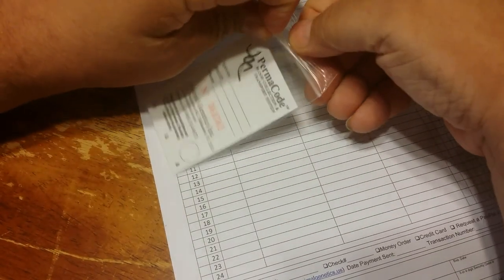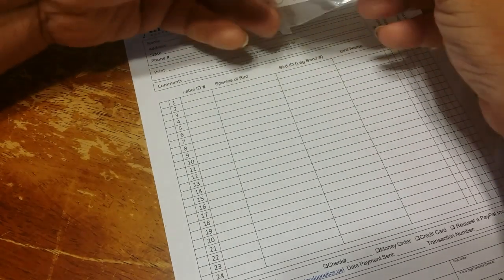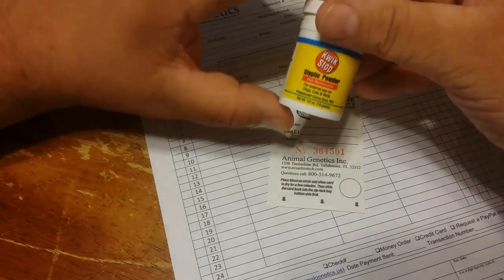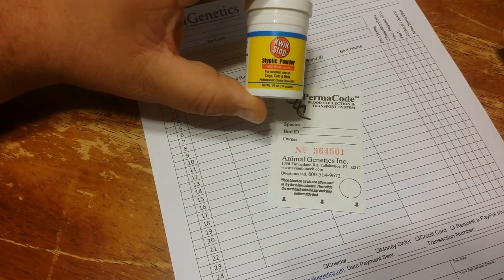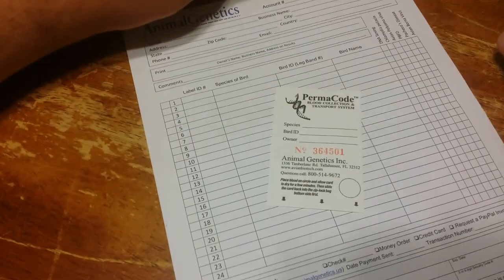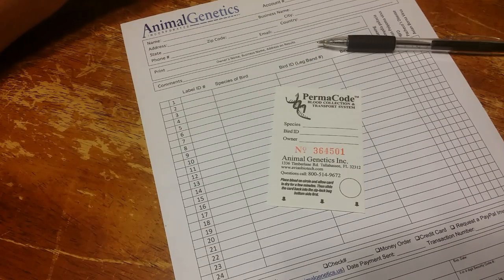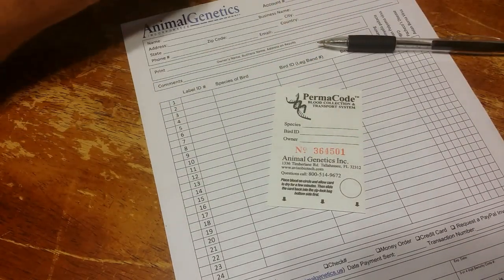With this little card, it comes in a little plastic bag. The very first thing you do is assemble some other supplies that you need. You're going to need Quick Stop — this is a styptic powder, a blood stop. You are collecting a DNA sample, a blood sample from the bird. I'm going to show you how. It is quick and simple. You're going to need a pin and a pair of nail clippers.